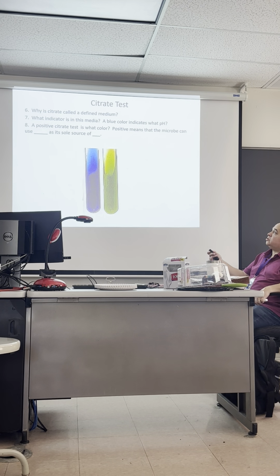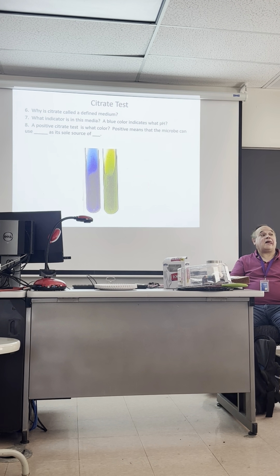Okay, so let's answer the questions. Why is citrate called a defined medium? It's chemically defined. So what does that mean? You know what's in it. That's all you need to put down. You can say there's a recipe, you know what's in it, it can be remade, whatever. All it tells the same thing.